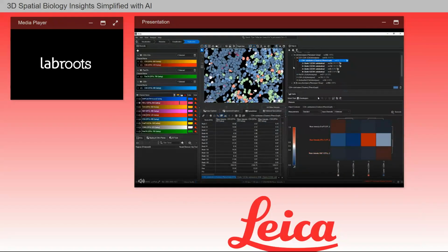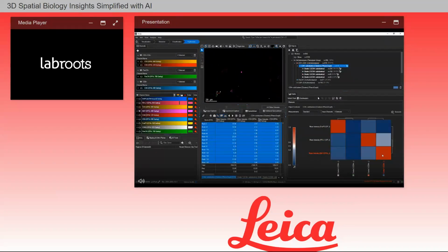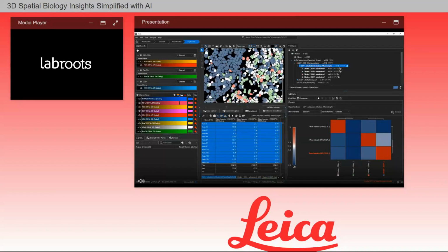I'm going to turn off the mesh rendering, so now you can see that as I switch to a different row to highlight, it also changes which channel gets displayed on screen. Finally, you can select one of the tiles, and this will display the channel, and when I turn the object set display back on, the objects associated with that group.